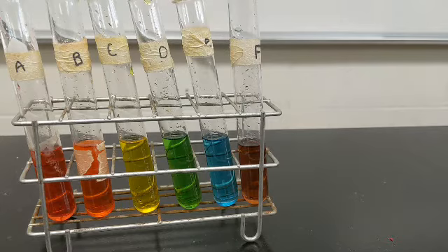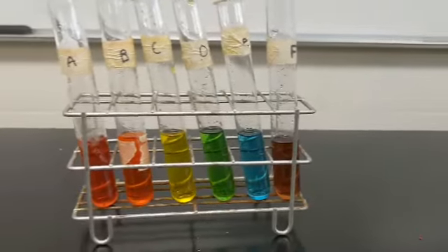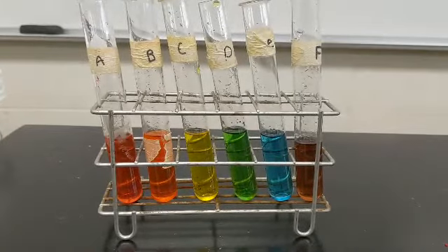It's more of a brownish orange, which doesn't sound like a real color, but you can put purple if you want, or you can put in the color that you see here on the video. Okay, it's up to you. This is an observation lab, and what you see is what you can record for your data. Okay, so get those colors in the data table, and next we will measure the final volume of each one.